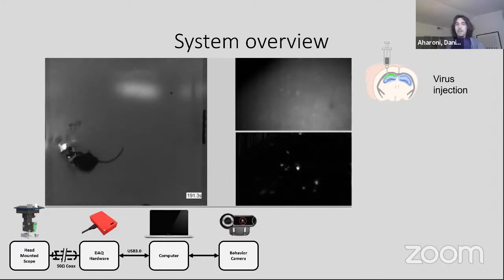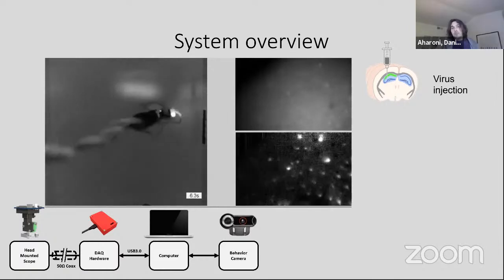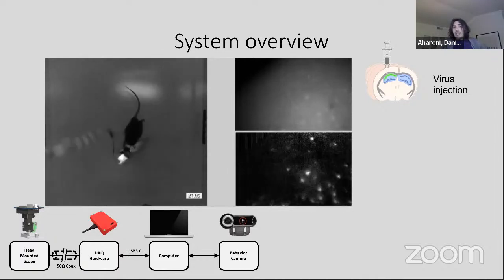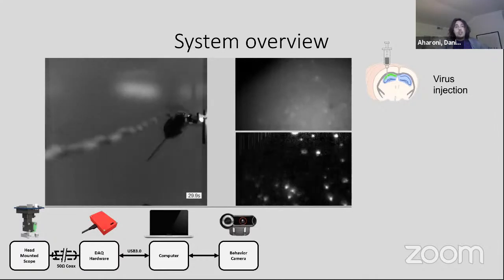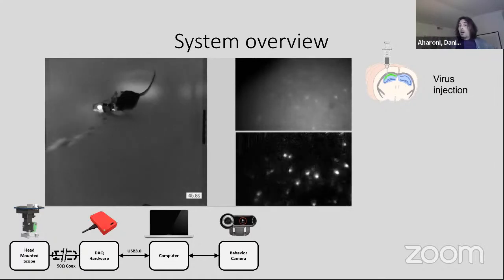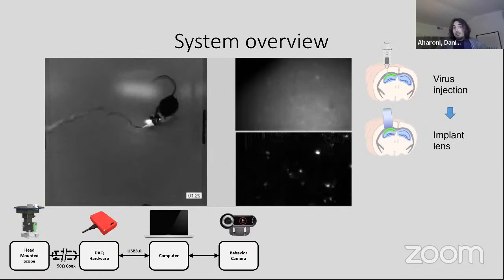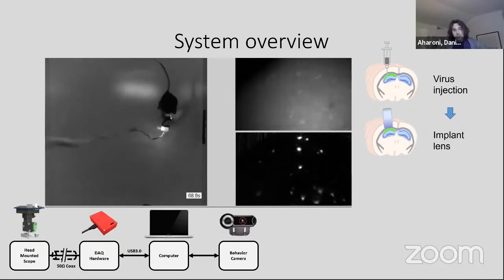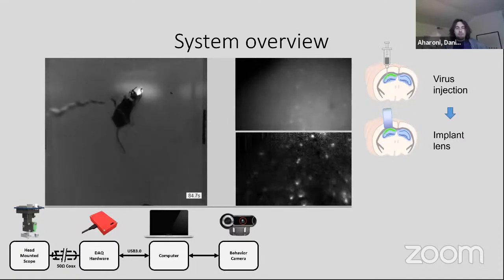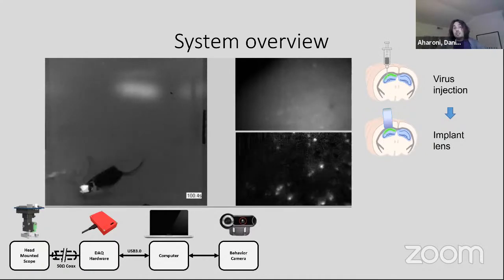Right, so if we wanted to image an animal, neurons on their own don't fluoresce. So you can use transgenic animal lines, but oftentimes you'll do a viral injection of a GCaMP in the brain region you want to image. Those cells get transfected with GCaMP, produce the GCaMP protein, and are able to fluoresce after a few weeks. We then need optical access to those cells. So if you're imaging cortex, you can now, with our newer miniature microscopes, just do a cranial window, just like you do for 2-photon imaging, and have the Miniscope mounted right on top of the cranial window and image into cortex.